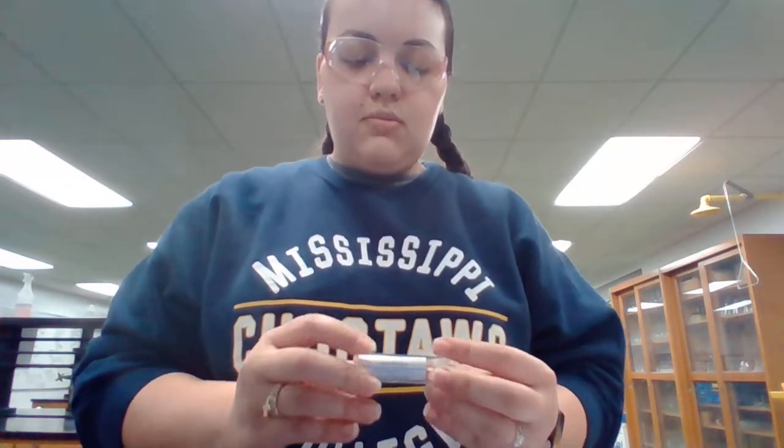So here is my container of red litmus paper, and all I did was get 1 strip out. And a common mistake people make when using litmus paper is that they want to take the paper and dip it into their solution. This is not correct. You can actually contaminate your sample if you do it too many times.